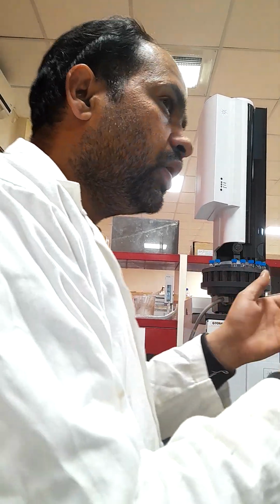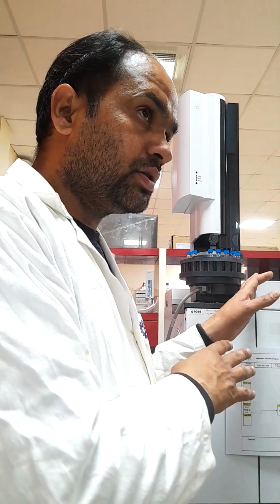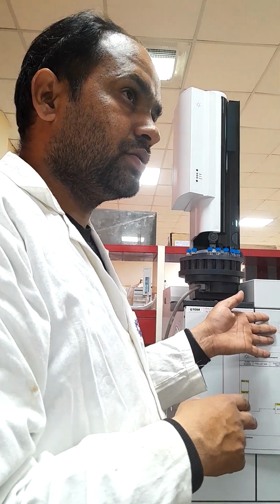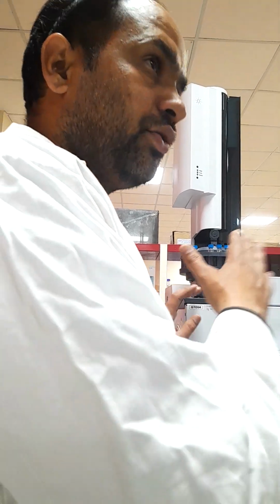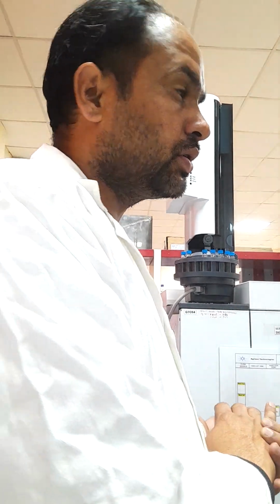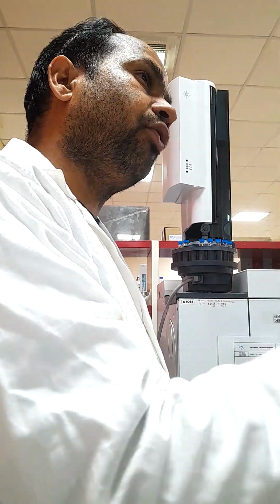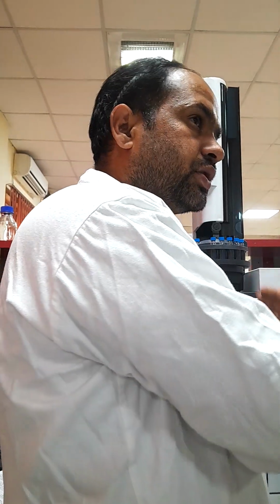So here in this technique, cracking does not happen because it is also in vacuum conditions. In pressure condition we are doing it. We are using 3 types of gases here. One, the red color mark, is hydrogen. Second one is helium. Third one is air. These 3 gases have different flow rates in running from inlet to detector through this column.